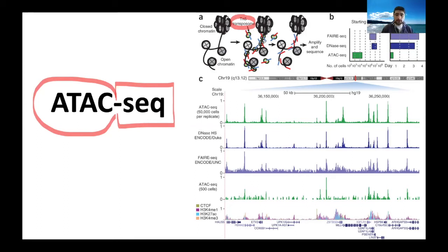If you remember yesterday, I talked about an application where we use exactly the same transposon. That was the Nextera type of library preparation, the so-called tagmentation, okay? In that case, though, we were using this enzyme on naked DNA, while here we are using this enzyme on the chromatin, okay?